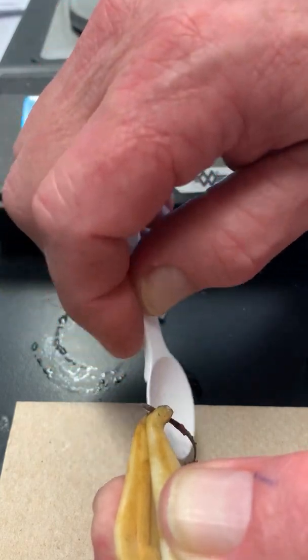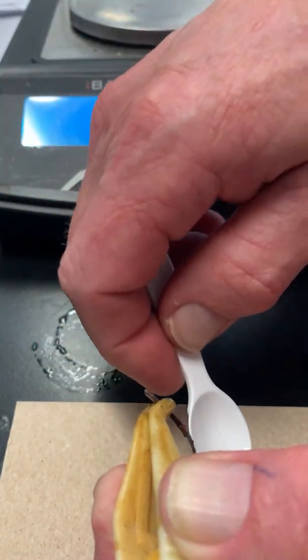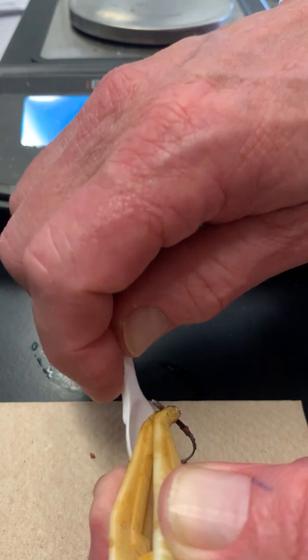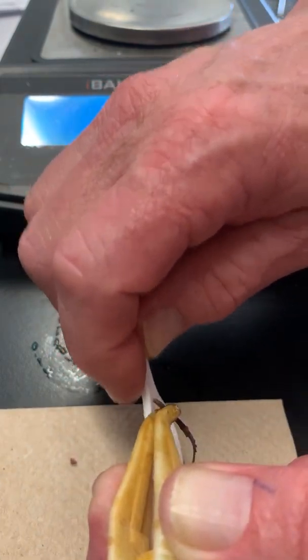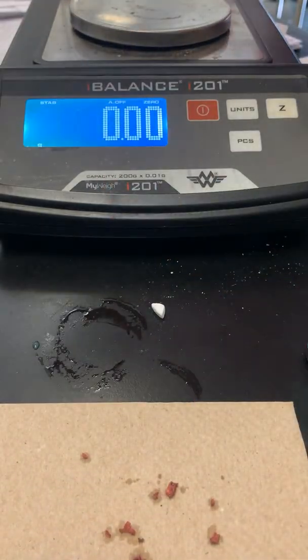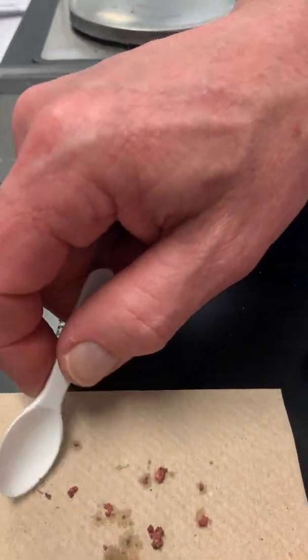Now, I'm not going to actually finish this because I finished it before, because the next thing you do, once you get all the copper on the paper, and I didn't get it all, you have to move it off and let it dry.